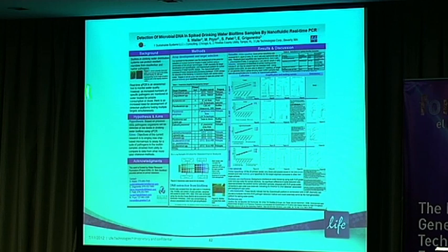This is early work where research groups were studying the use of OpenArray technology for various applications. In this case, we're looking at testing of biofilms and water sample testing, the ability to screen water samples very quickly for different bacteria and pathogen particles located.